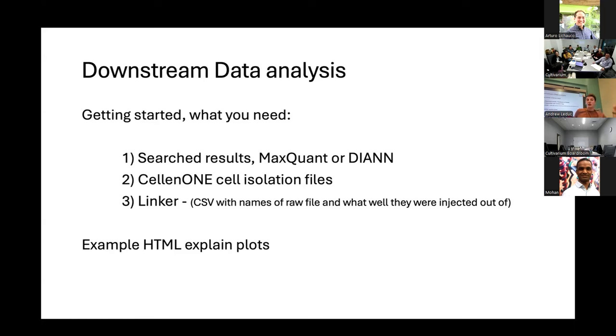And a lot of times, the names of these positions are appended in the raw file. So you could just read in your data and subtract out the well position, but it's not always there, so I didn't want to make it automatic.